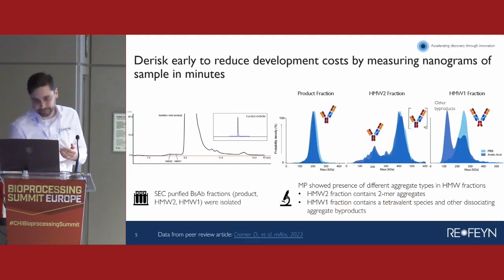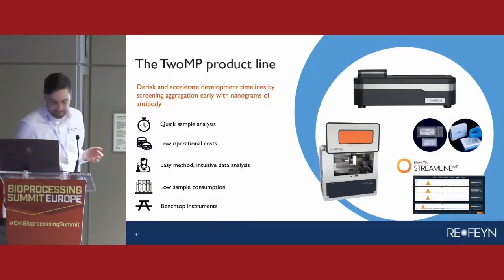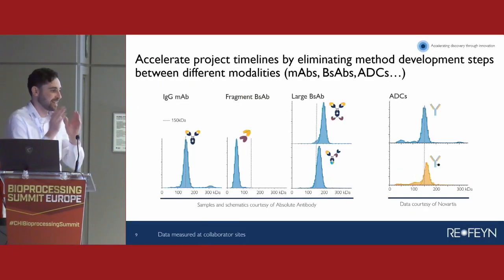I would expect that the peak would get wider if you've got a lot of variation, and narrow if you have less variation. But it is very much an average, and whether it's useful in that context very much depends on your situation. This was a nice bit of data which was flagged to us by one of our customers, so it's nice to show it off. Thanks.